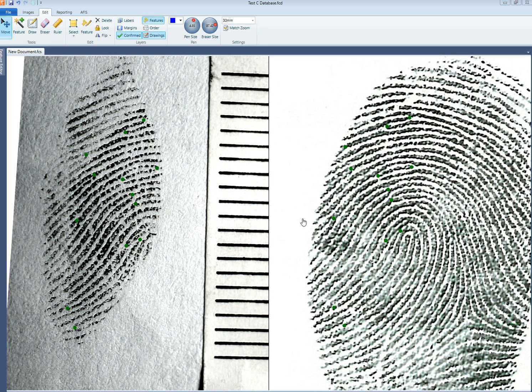I'm now going to show you how to do an instant chart using forensic comparison software. To do that I start with an already marked up comparison, and in this one you can see that all the features have been marked with a green dot.